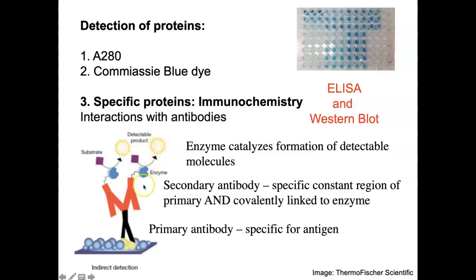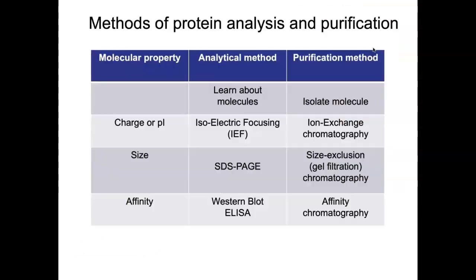And when I say amplify the signal, one molecule down here will give you many molecules that you can detect. So this is the source of sensitivity of both Western blot and ELISA, which works very similar, except it's not on the membrane. It's usually done in a 96 well plate. And we'll talk about ELISA in another lab.